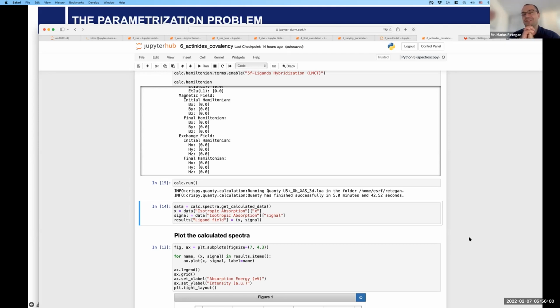Which is weird, because that's the easiest solution, and it requires, to some extent, the least amount of work, because afterwards you need to develop tools which are able to convert. Development of a graphical user interface to do calculations or data processing is not easy.